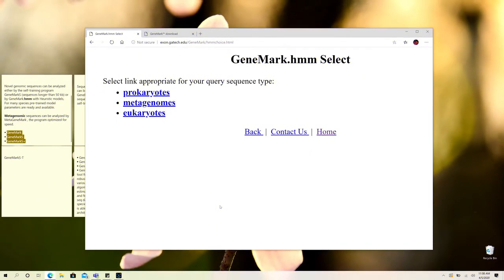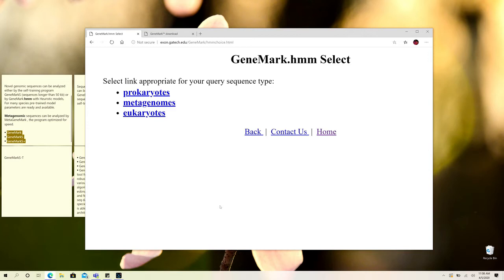In this video we will show you how you can utilize the GeneMark tool for the prediction of genes from a novel genome that you have just sequenced from a particular laboratory or through a research project.